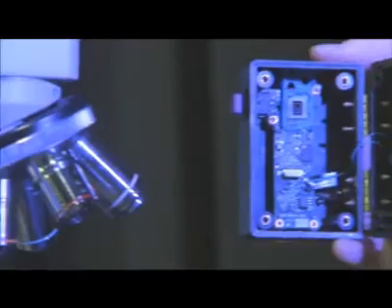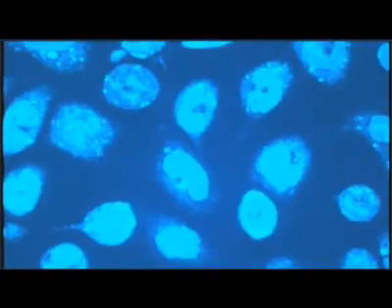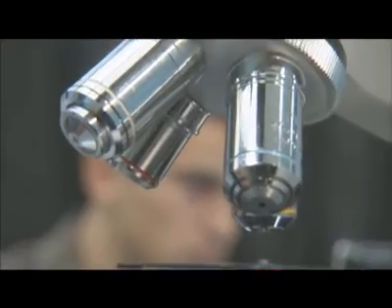The digital camera's sensor captured a holographic image of the cells that contained vastly more information about the shape and the health of the cell than a regular microscope could. Ozcan had invented a new way of looking at microscopic particles without using lenses.